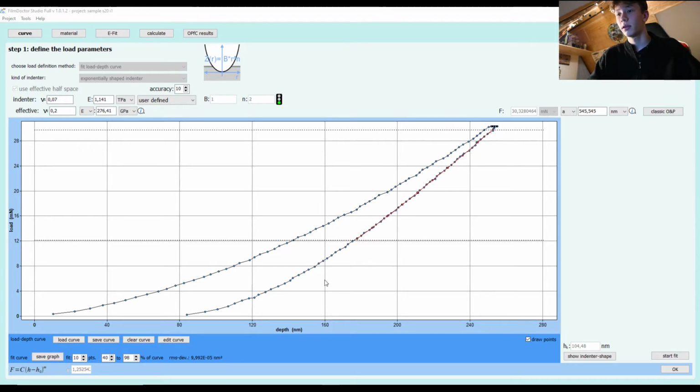As you can see, in our material there stays a small hole from pressing onto the surface. And this curve, most importantly this part, is what the OPfC calculates with.